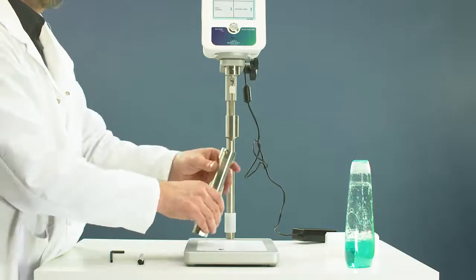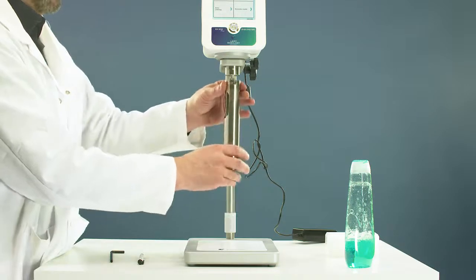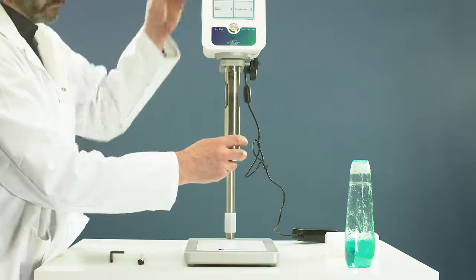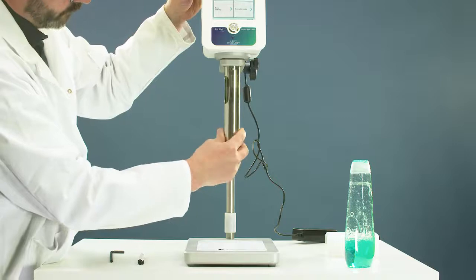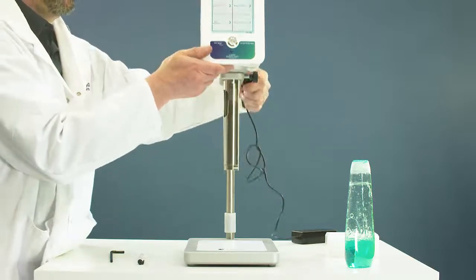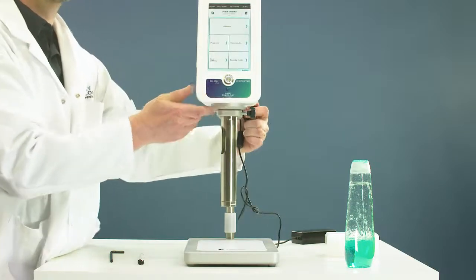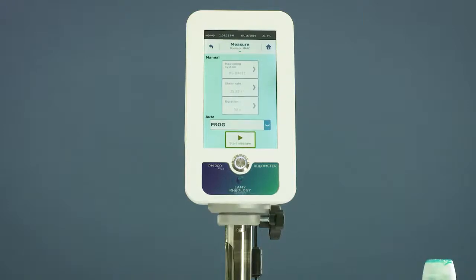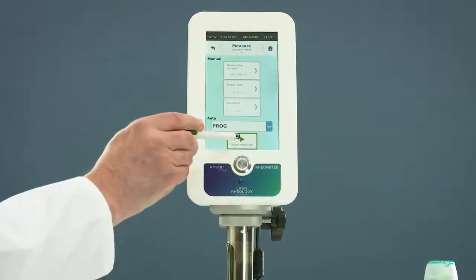Install the tube DIN1 with the sample inside. Start your measurement and give a name for the result file.